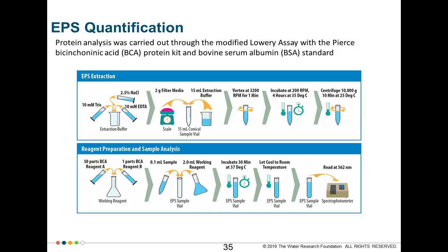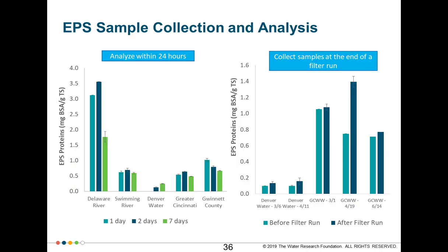the sample. Sorry, my slides are getting moved around. Okay, so the concentration of protein was then normalized to 1 gram of total solids, which is based on the dry weight of filter media.